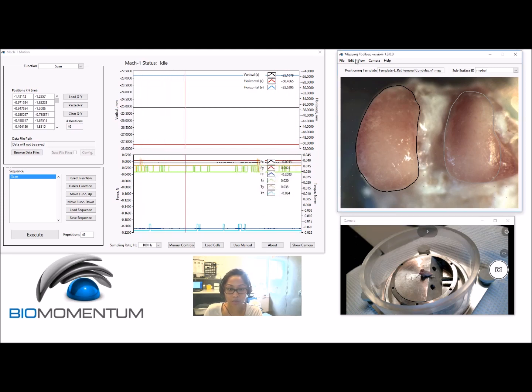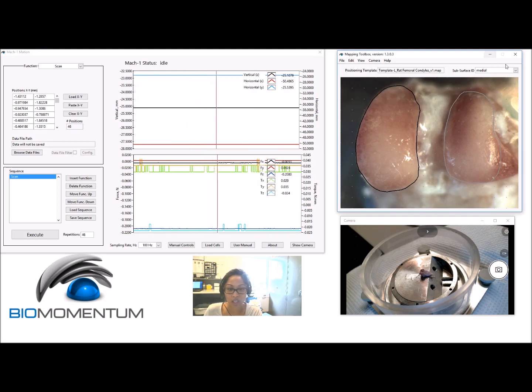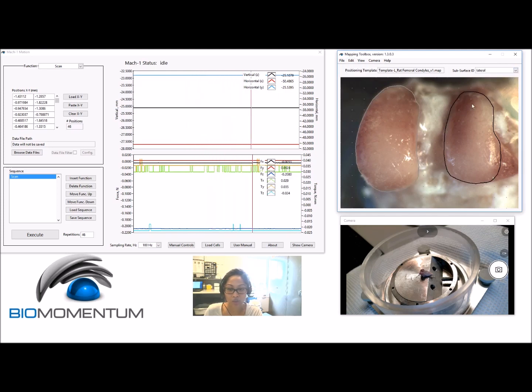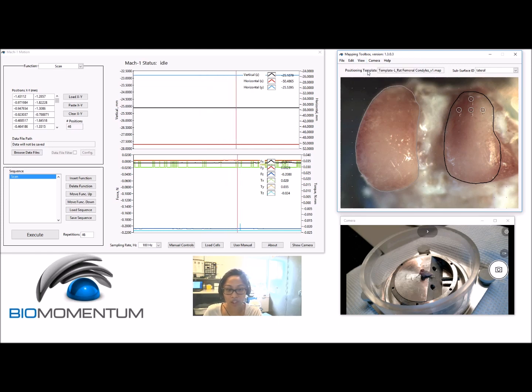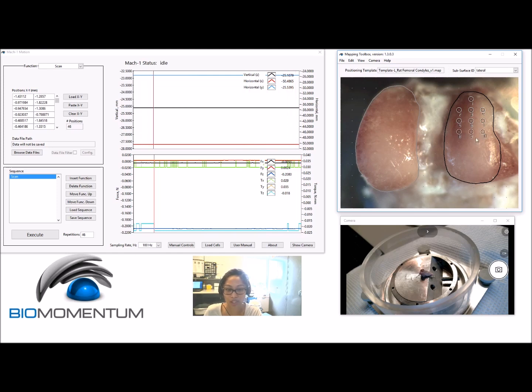Select the appropriate subsurface ID before adding a position in order to assign the position to a subsurface. Then choose Add Positions and click in the camera feed to add positions at locations of interest on the sample subsurface.